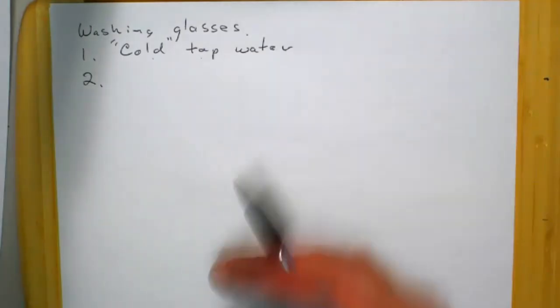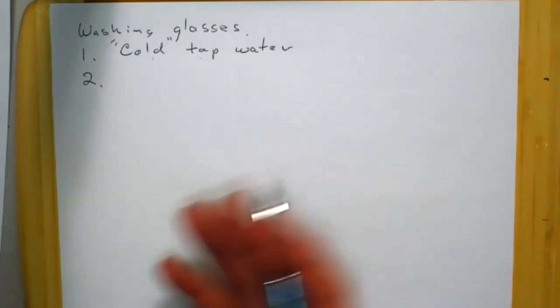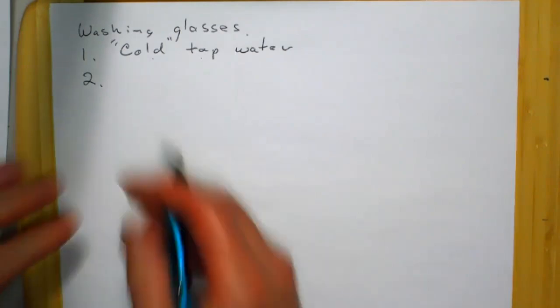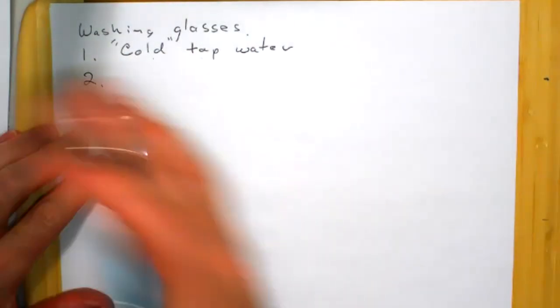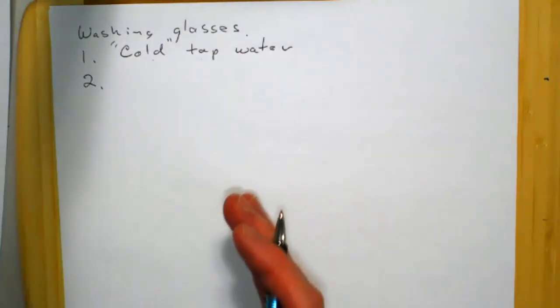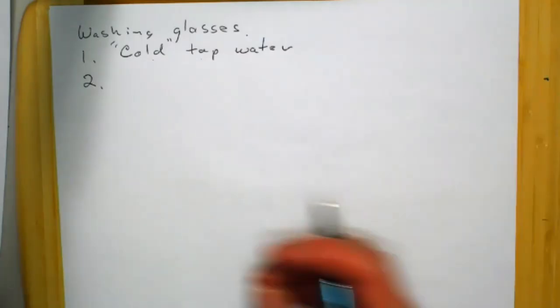That's why wearing a lab coat is usually a good idea. Gloves are always a good idea, and this year they're required. Because your dirty little grimy hands, I mean, you don't have ex-president hands, but everybody's hands are dirty and grimy.